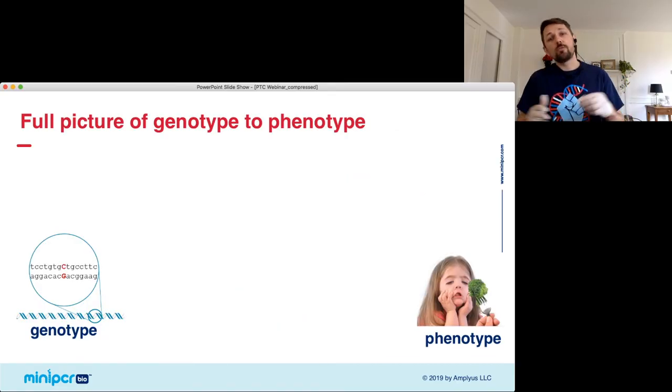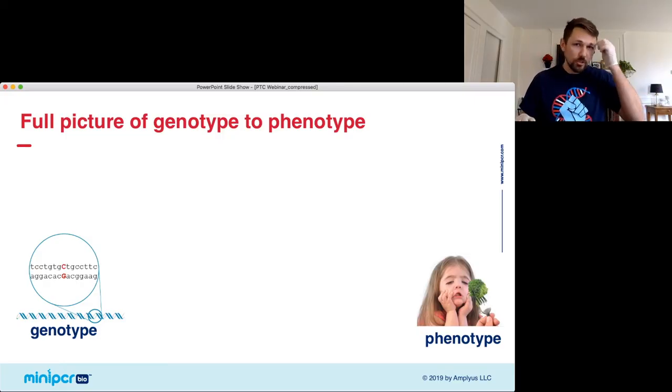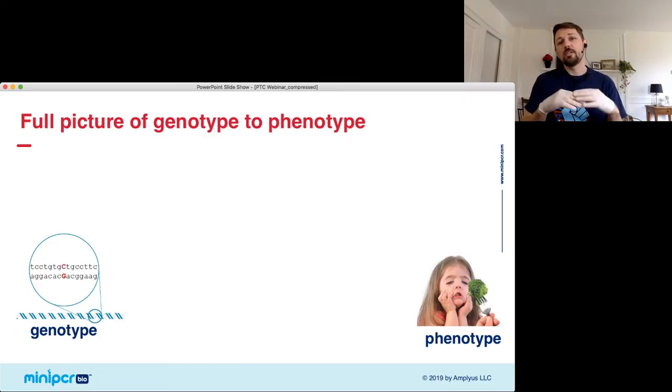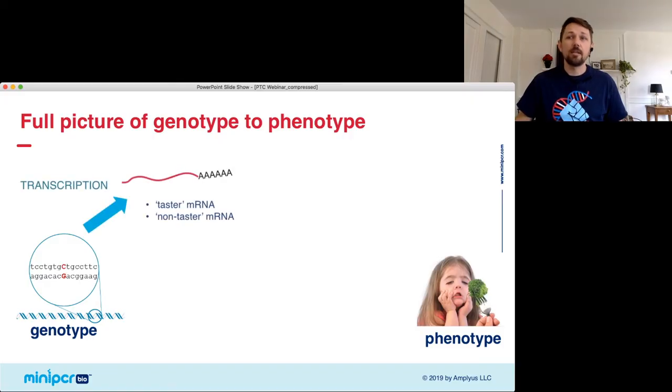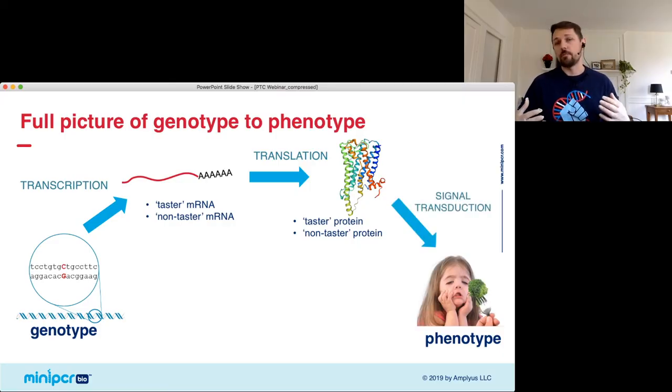Okay, so just to wrap things up, and we do have some more after this, we're going to answer some questions and tell some extensions and things to do. But just this entire lab, hopefully you see how I sort of took you in reverse order, but we started out talking about a phenotype. We looked at all the different genotypes. We're able to connect it through the messenger RNA to talk about the different types of proteins that you could make and how those proteins interact in a signal transduction pathway to give you a differential response.